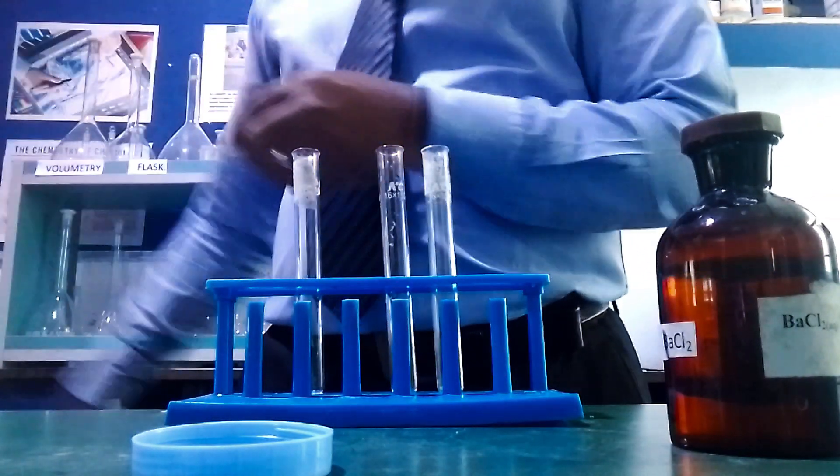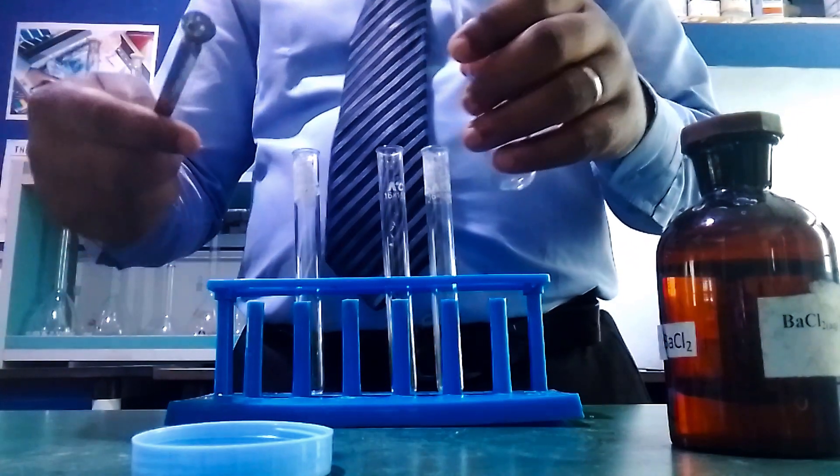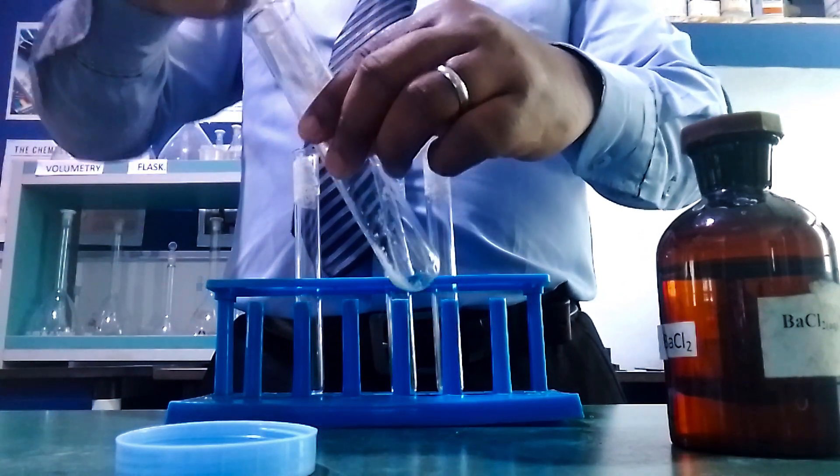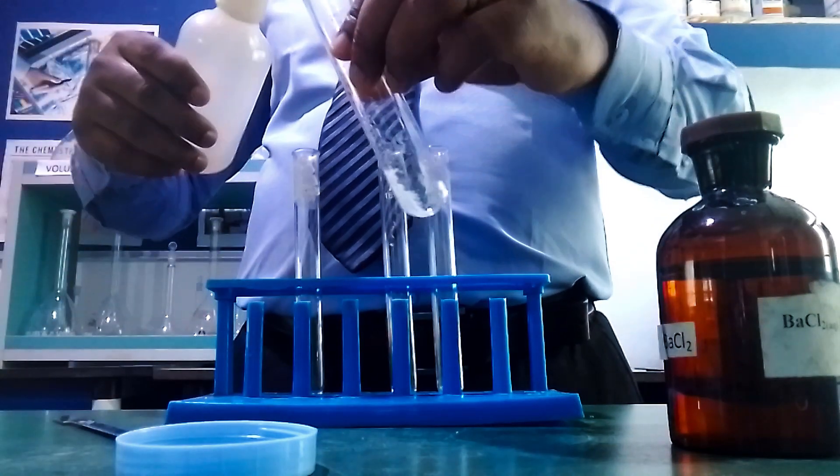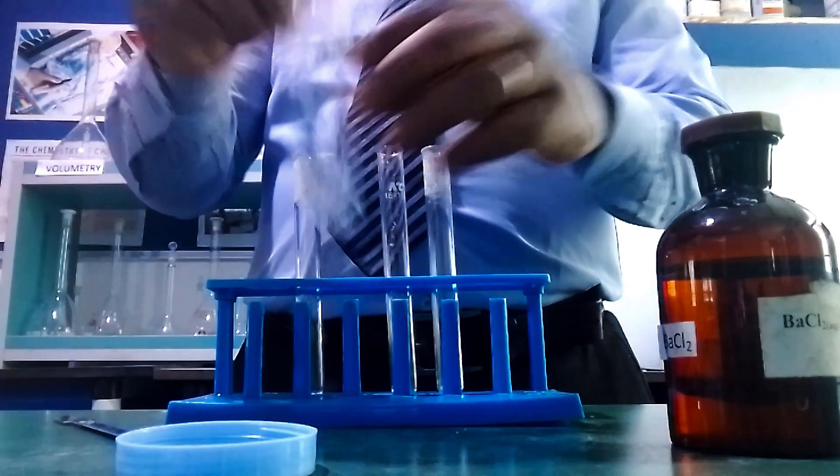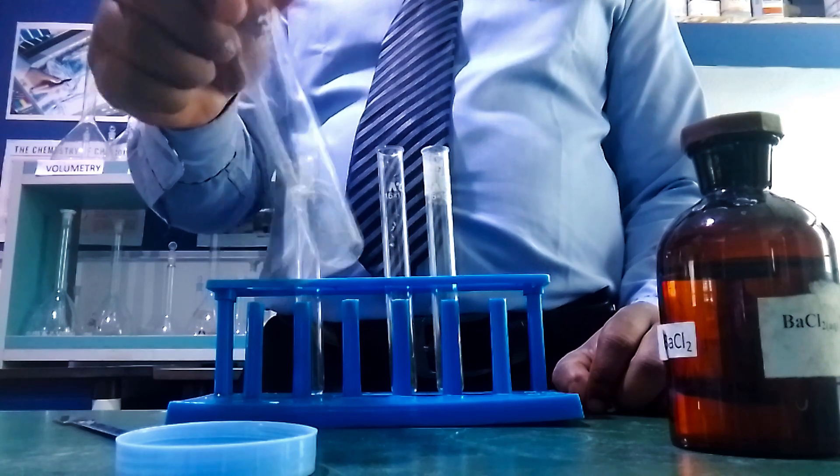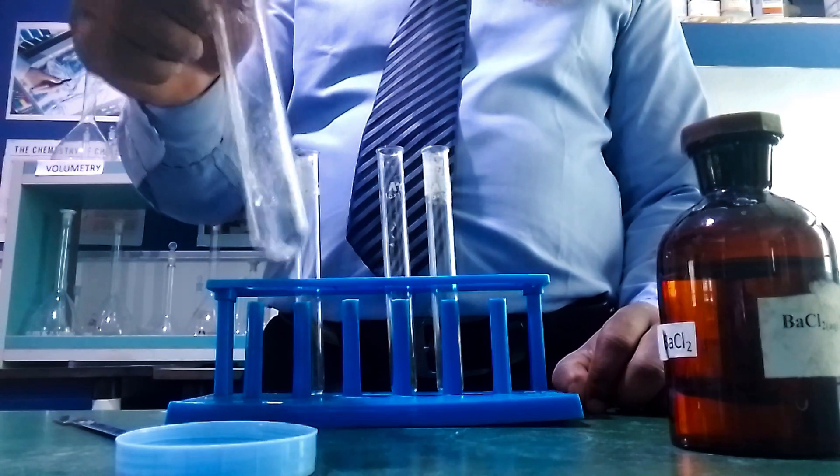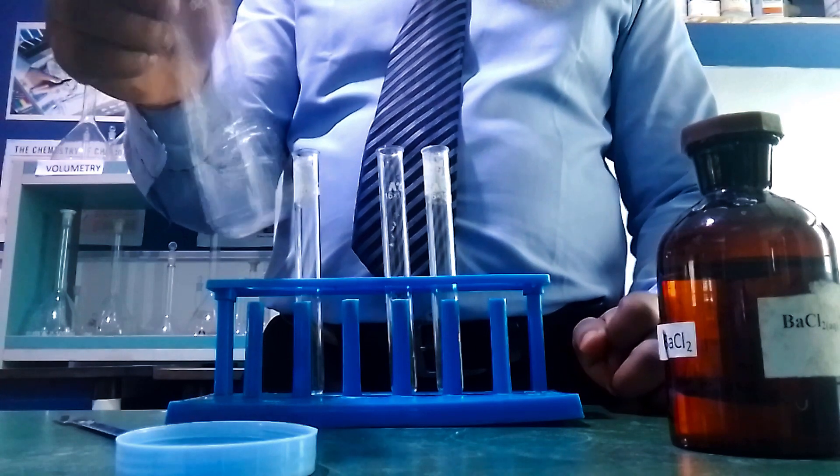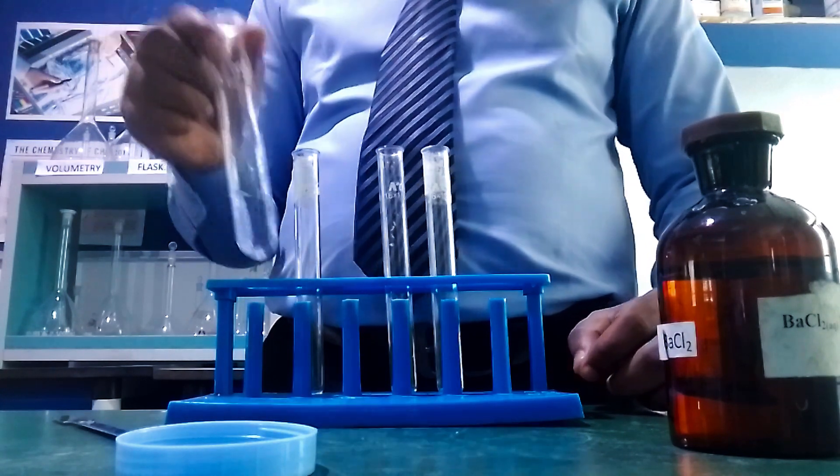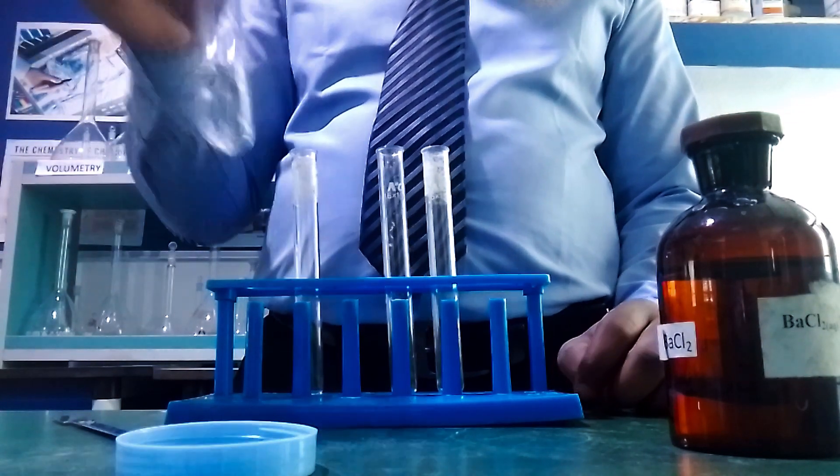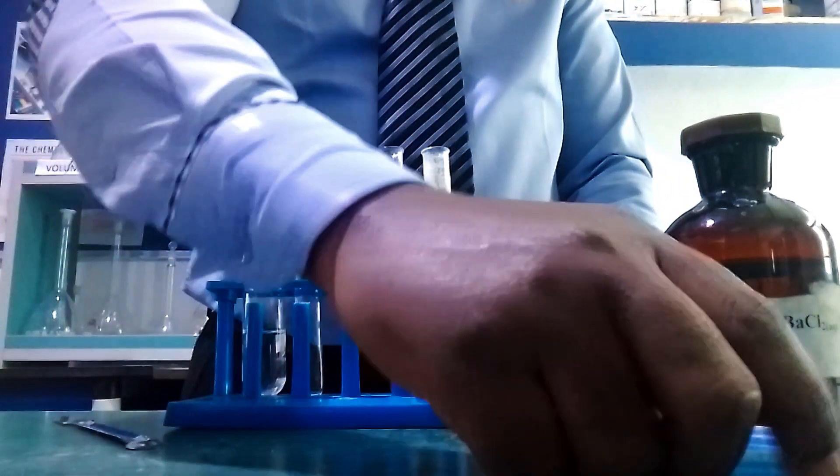I'm going to use a boiling tube to prepare a solution. Take a little quantity and add water to it. This salt is soluble, so we expect everything will dissolve. If it's a salt of a Group 1 element, almost all Group 1 salts are soluble. If yours doesn't dissolve, shake thoroughly or add more water. As you can see, this has dissolved completely, giving a colorless solution.